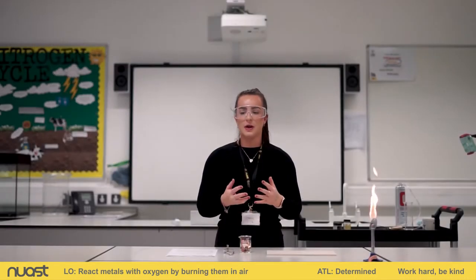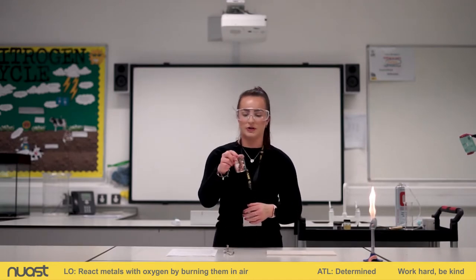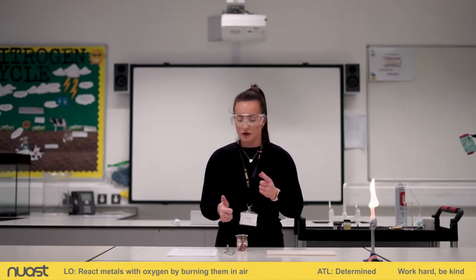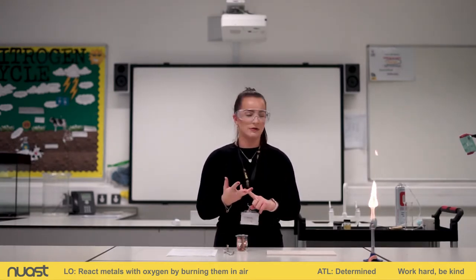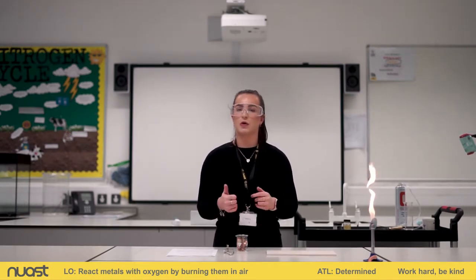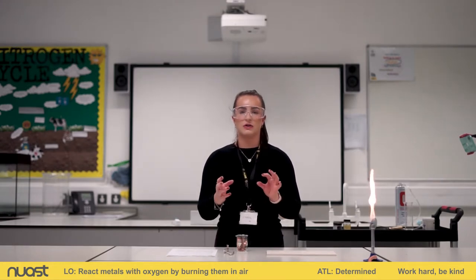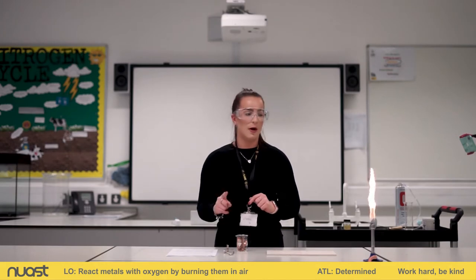The first metal that we're going to start with is our copper. I've got some copper here. We're going to do four mini experiments: one with copper, then magnesium, iron, and calcium. We're going to compare their reaction with oxygen in the air. We're also going to use magnesium with a high concentration of oxygen later on in the video, but we're just going to start with copper first.